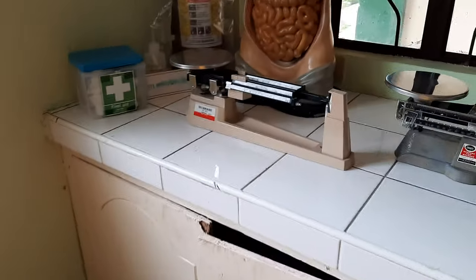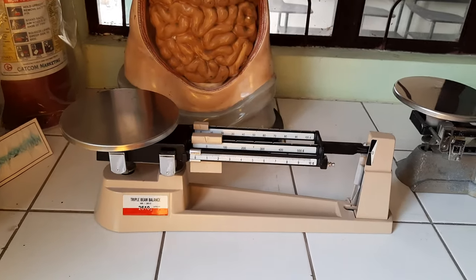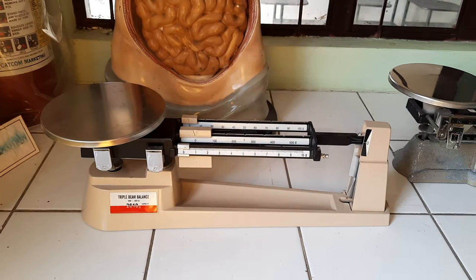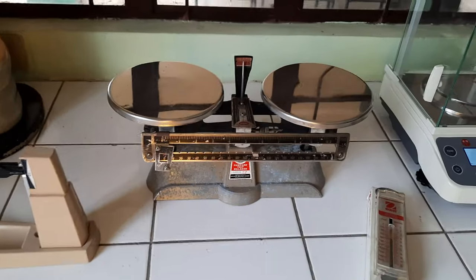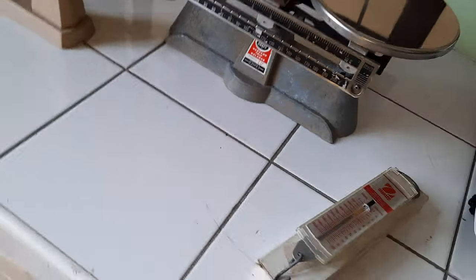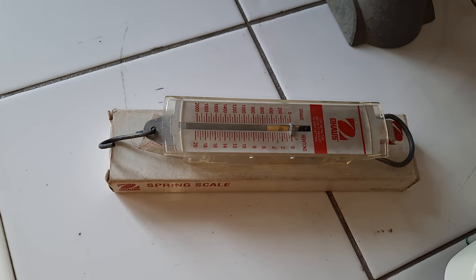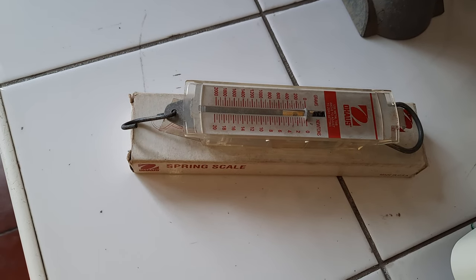First we have our mechanical balances or manual balances, such as this triple beam balance. We also have our double beam balance or platform balance. We have our spring balance, which is also used to determine forces, as classically used in physics experiments.